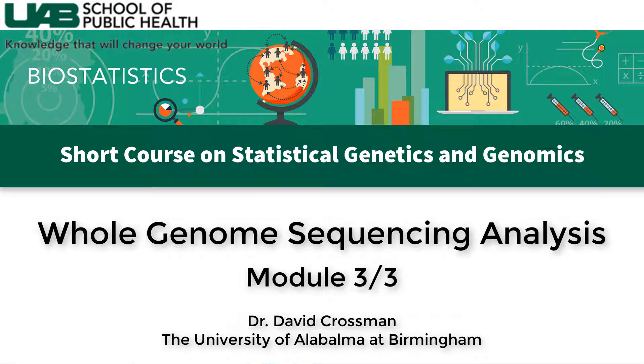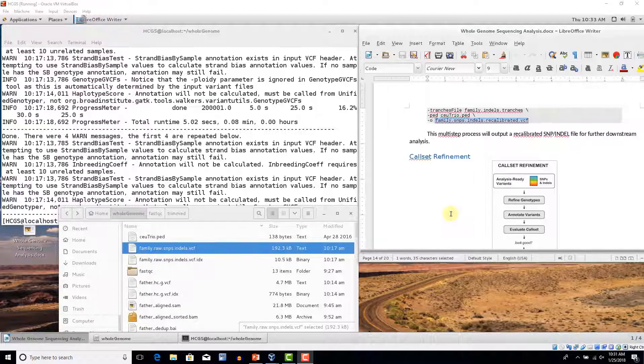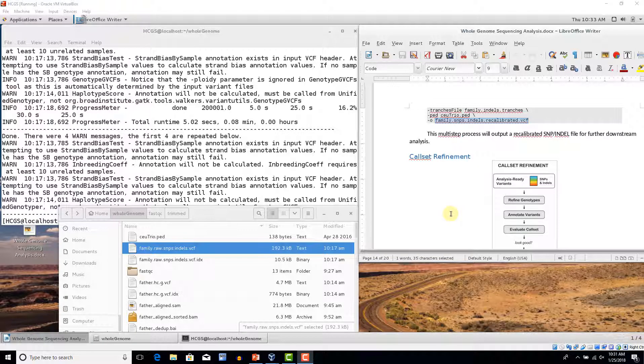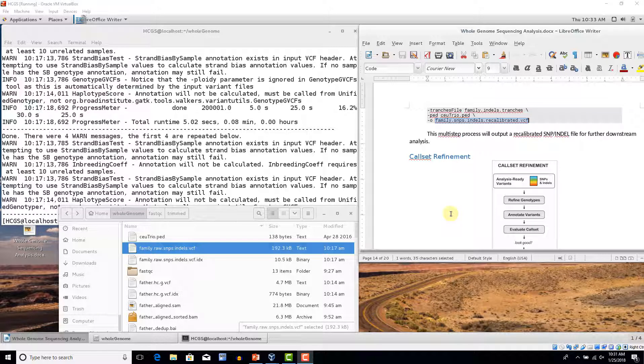Now we're at phase three, call set refinement. This step varies greatly on what it is that you are wanting to identify at this step.